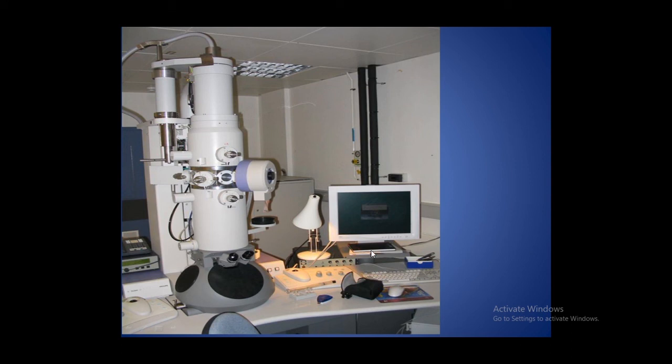This is how a real electron microscope looks like. This entire thing is in a vacuum, and there will be all the structures, that is the source of electrons, the electron gun, electromagnetic plates, and your specimen. Everything will be here, and people can observe through these lenses over here. They can observe the specimen from here, and whatever they're observing they can see on this monitor as well.